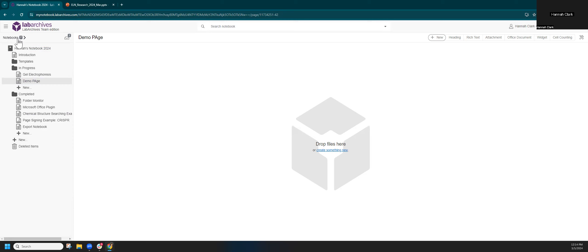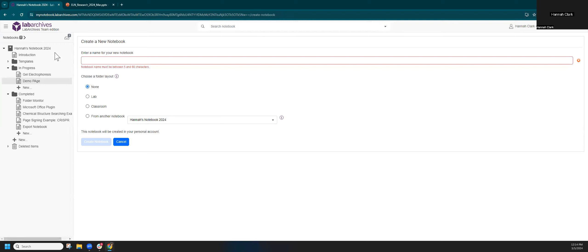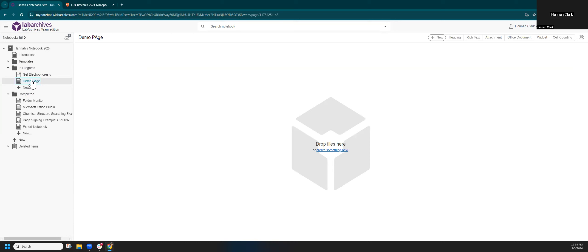At the top here you'll see I have several notebooks under my account — some are notebooks I've been invited to, maybe from a lab down the hall. I can make more notebooks with this plus icon, creating separate notebooks for different colleagues, projects, or things going on within your team. You can name your notebooks whatever you like, select folder layouts, and create some folders to help your team get started, perhaps matching your existing network drives, Box, or OneDrive folder structure.